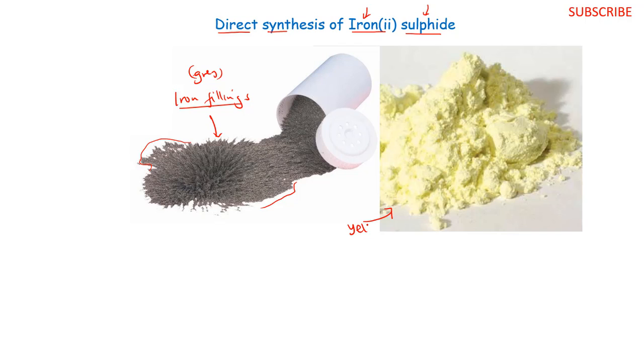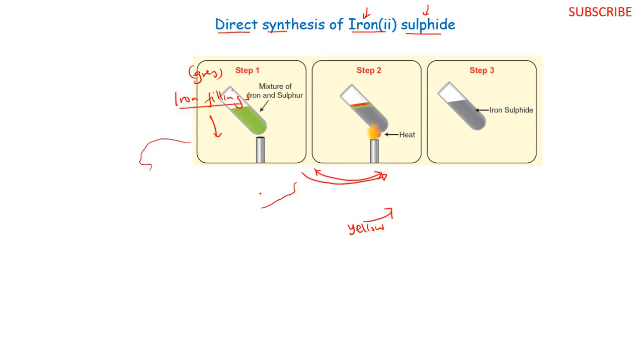So all we have to do is to first mix these two before we apply some little heat. So we shall need some container, mix this iron filings with this sulfur, and then we shall apply some heat and see what happens. So it's basically going to take three stages or three steps as we are going to see.